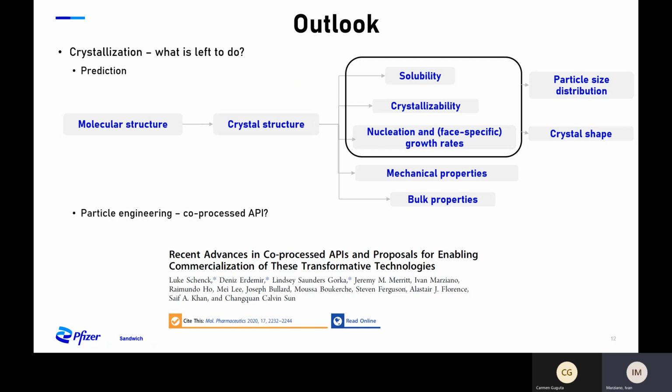And I've highlighted some areas where I think, of course, the Crystal16 still very much plays a role, in terms of helping us to understand solubility, but also in terms of building standardized databases that we can start to use for machine learning predictions around solubility, crystallizability, and nucleation. So again, I very much think that tools like the Crystal16 play a big role there.